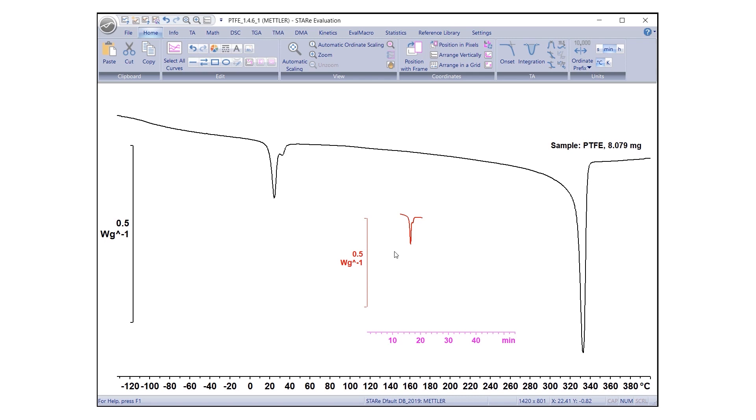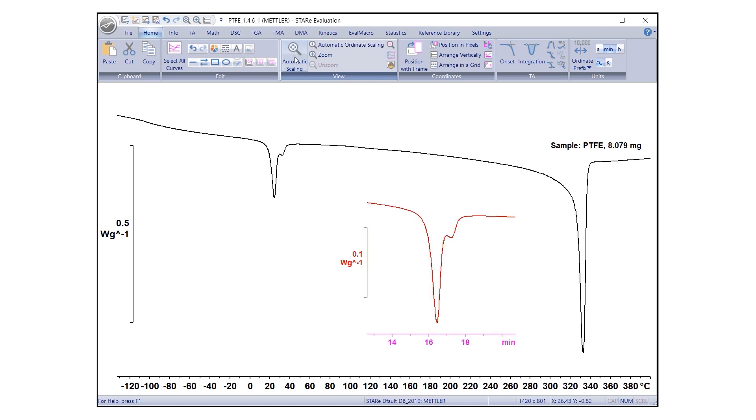To rescale the cropped section, go to View under the Home tab and click Automatic Scaling or press Alt plus A. The selected section of the curve is now displayed in a separate coordinate system.